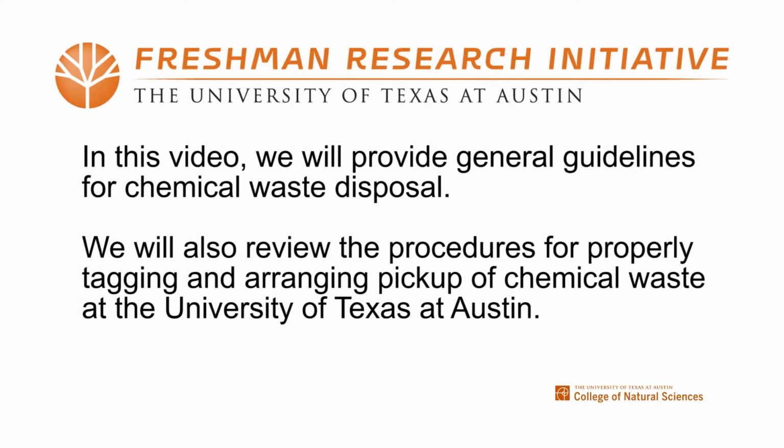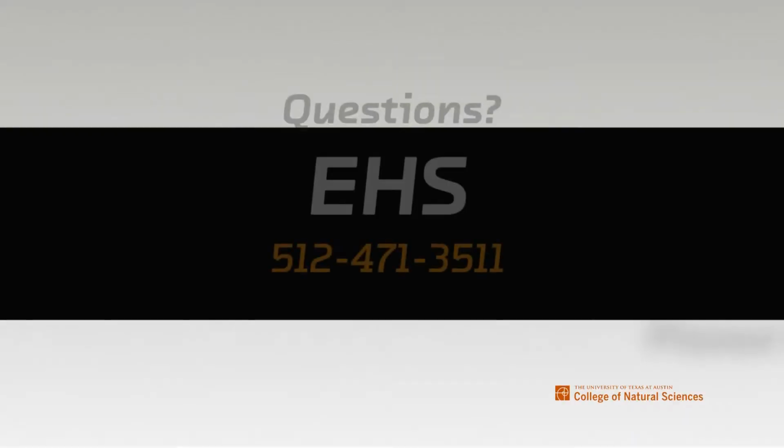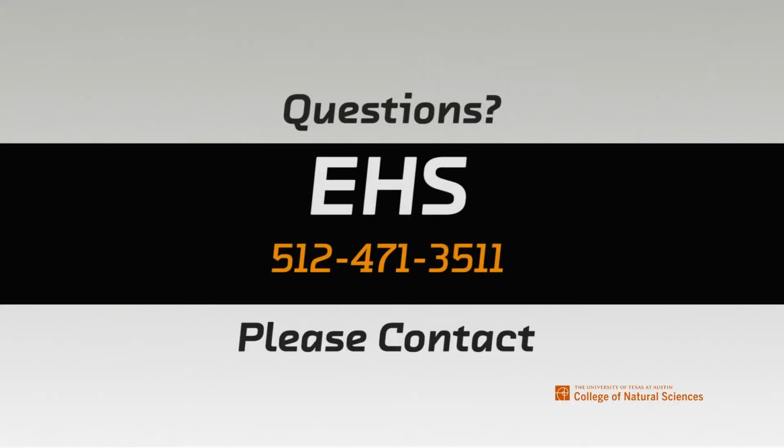In this video, we will provide general guidelines for chemical waste disposal. We will also review the procedures for properly tagging and arranging pickup of chemical waste at the University of Texas at Austin. This video provides brief waste disposal guidelines. If you have specific questions about waste that are not covered here, please contact Environmental Health and Safety.